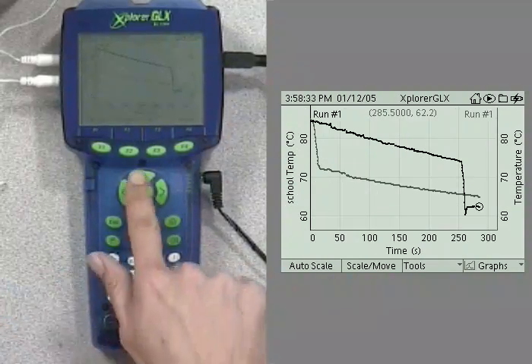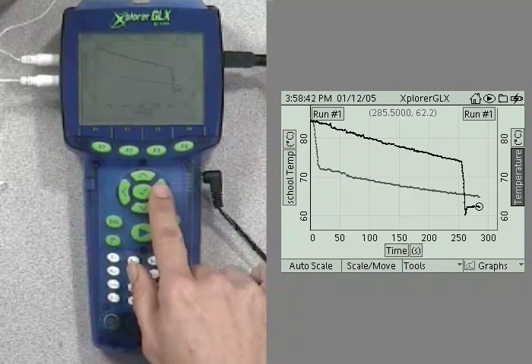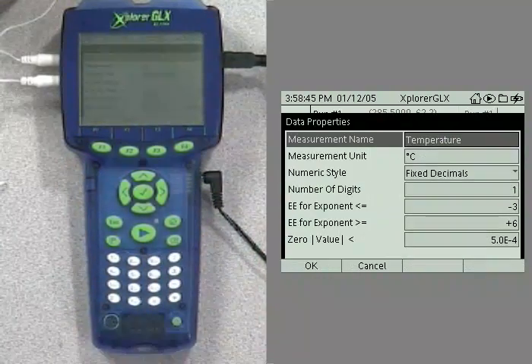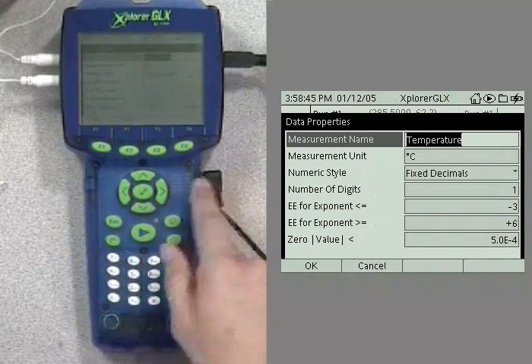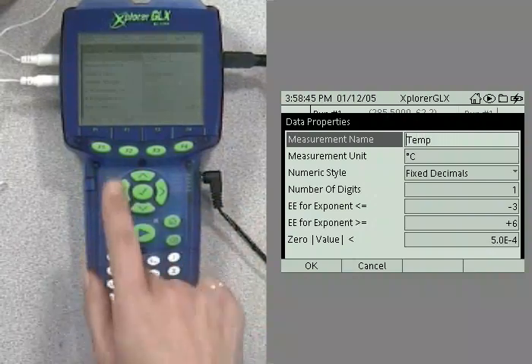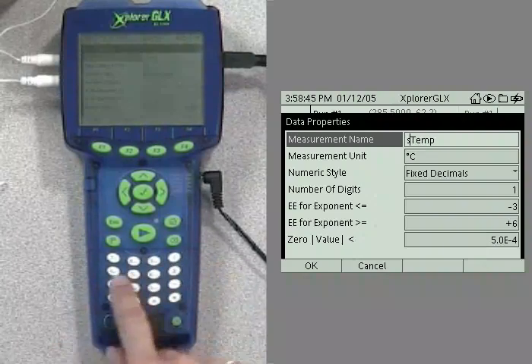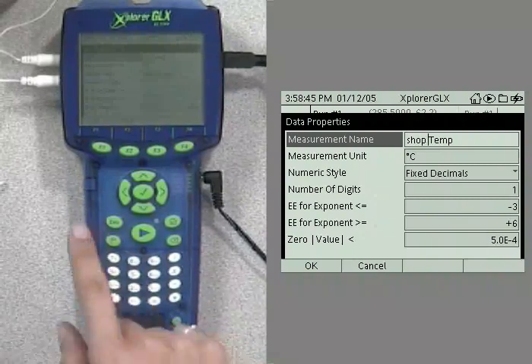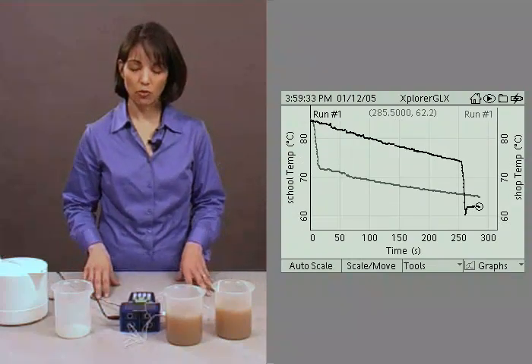So first thing we want to do is access our hotspots by pushing the check mark. And we need to move around to our other measurement. That's what the arrow keys are for. And you just keep pushing until you get to the hotspot you want. And then you push the check mark again. And we're going to select item number three. And we're going to change this one to shop temperature. Check mark so we can start editing. And then right arrow to get to the end of the word. Backspace over the letters we don't want. Arrow over the letters we do want. And now we're going to type in the word shop. We'll start with the S again, P, Q, R, S, H, M, N, O, and finally P. And then our space key again. And now we're done with that. So we say OK.